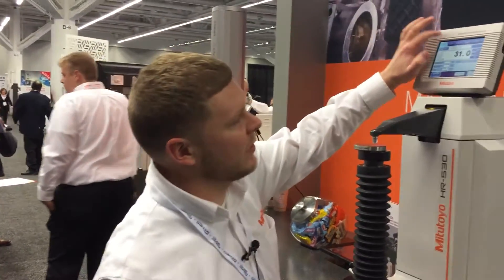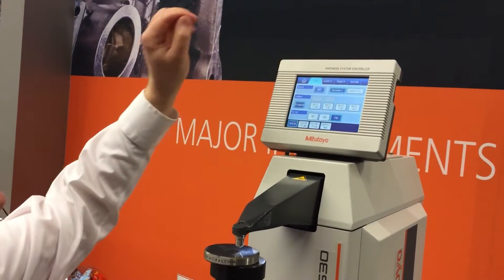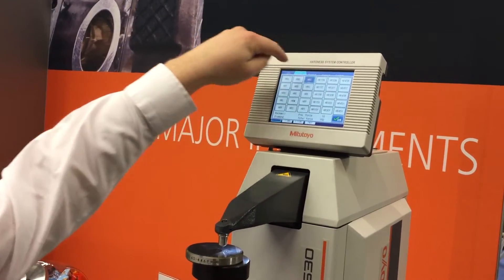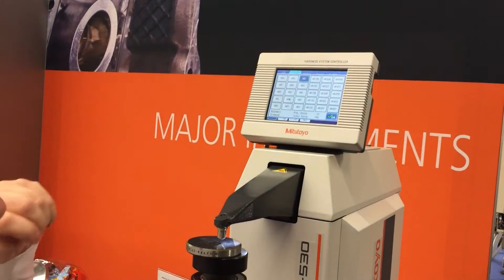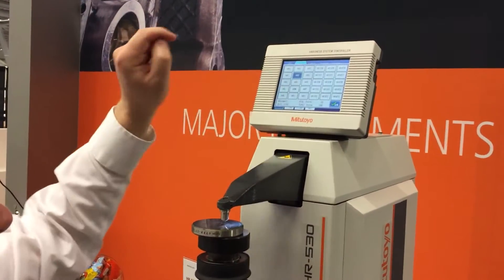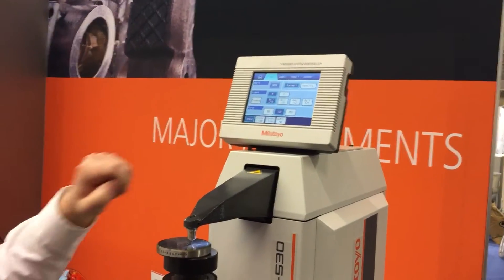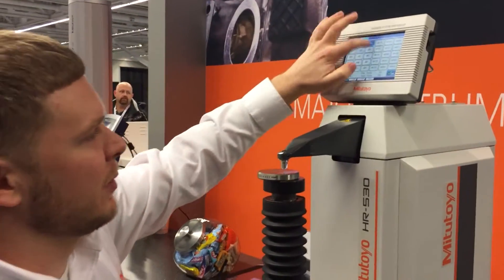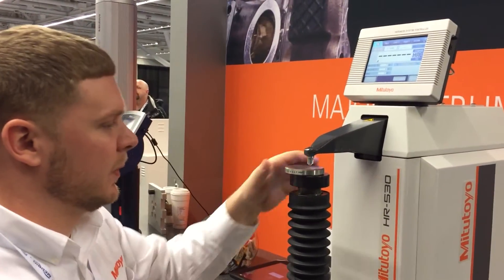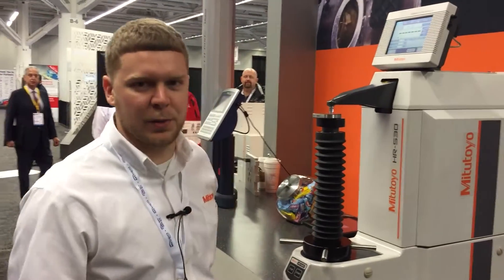To change between tests, you just come up here to the test option. Here you can pick from all your different tests — pretty easy. So if I did HRB, I'd say okay, confirm, change out the stylus to a ball, and then we're good to go. I'll go ahead and change it back to what we were at and hit the home screen. Now you're ready to take a measurement.